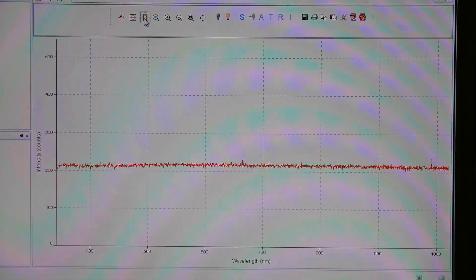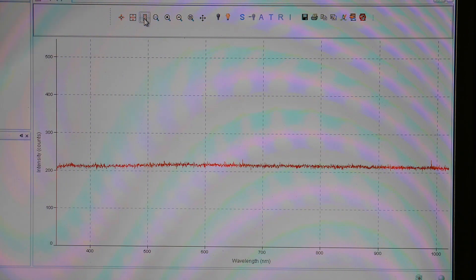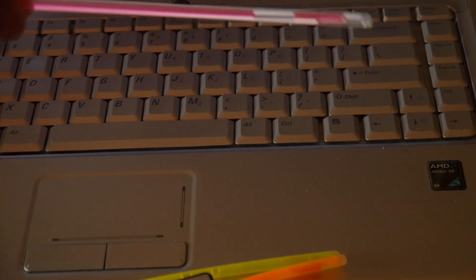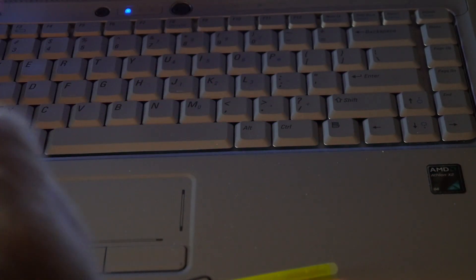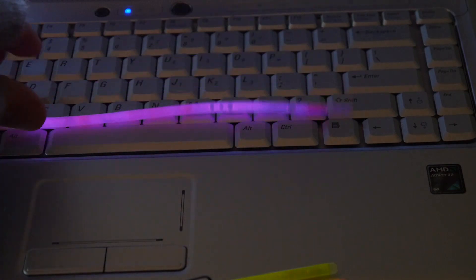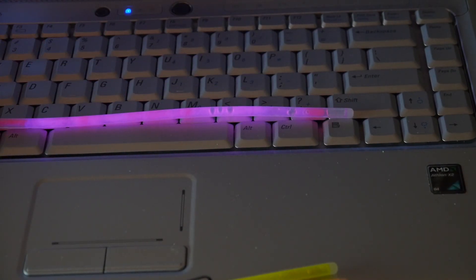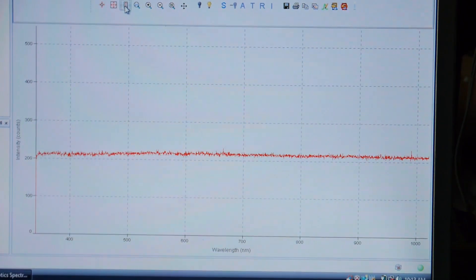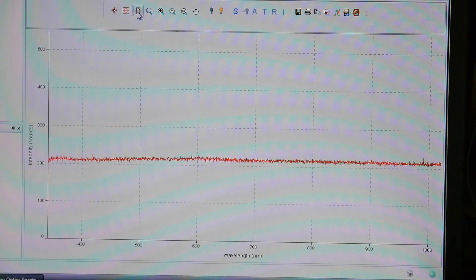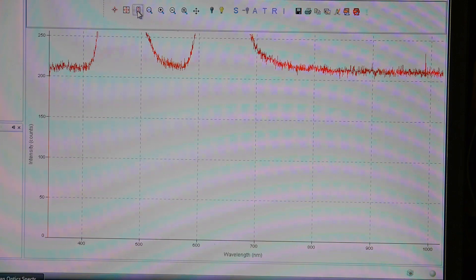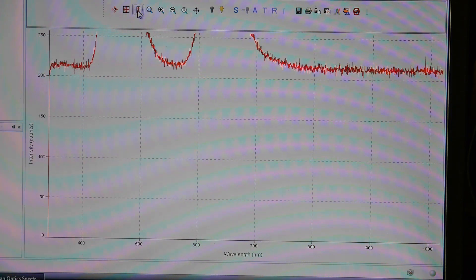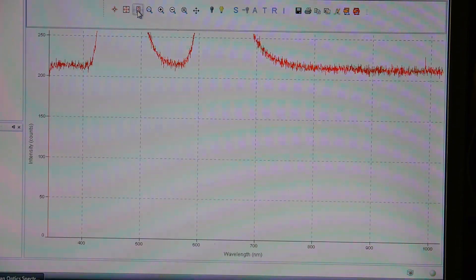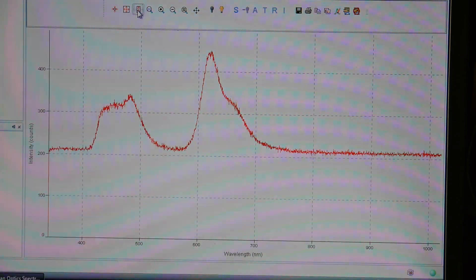Alright, next color. How about this one? So this looks like a red. Oh, it looks kind of like a purple. Oh there we go, purple color. Let's see that. Mix this together as best I can. There we go. Okay. Let's see what purple. Purple it is. And get it back on the screen. There we go.